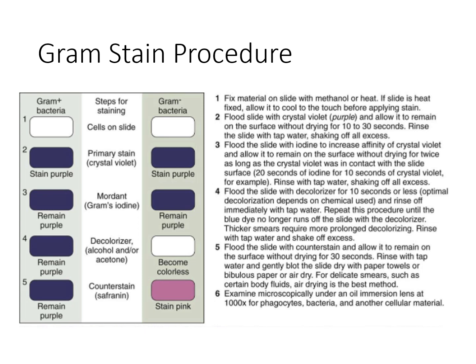and let that sit, and then you will rinse that off and let it either air dry, or you will press it between paper to dry off any of that moisture. And then after it is dried, you will look at it on the 100x objective, or that would be 1000 magnification, and this will be your oil objective. And you're looking for any sort of white blood cells, red blood cells, bacteria, or anything else that may be present.